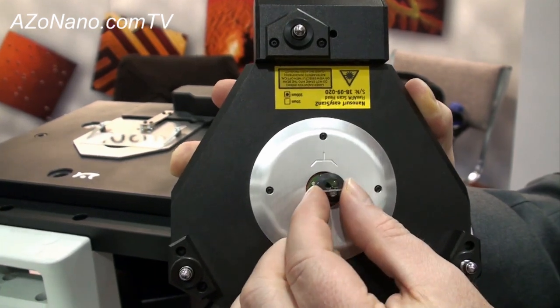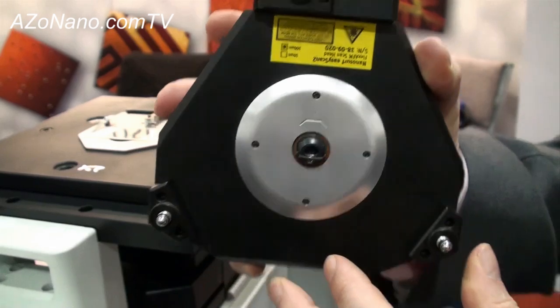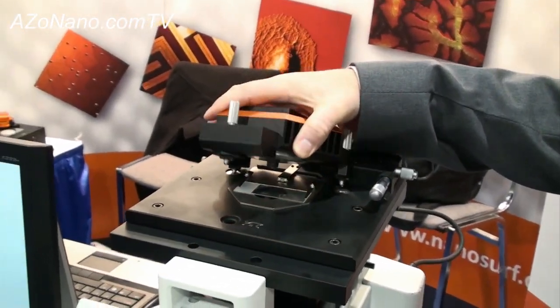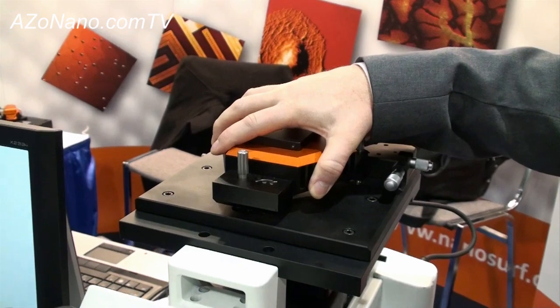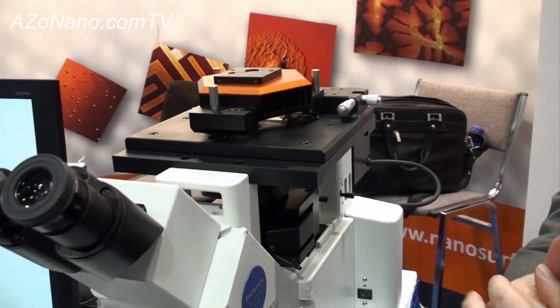This is our first system that utilizes a liquid scanning capability. One of the main purposes of our display here today is showing one of our new options that utilizes that liquid scanning using the Flex for bio types of applications.